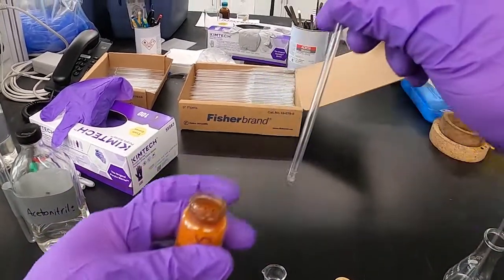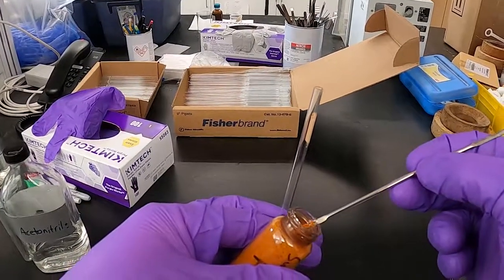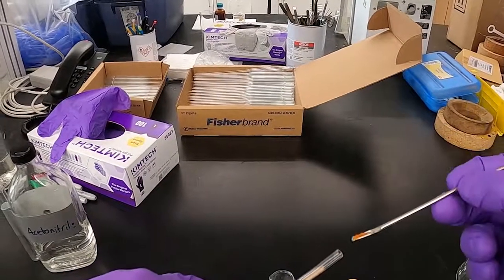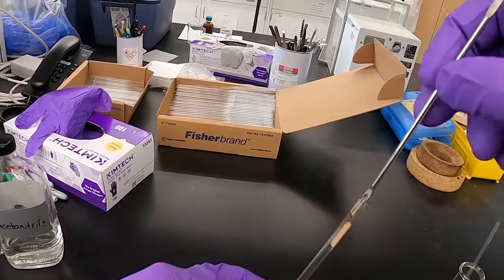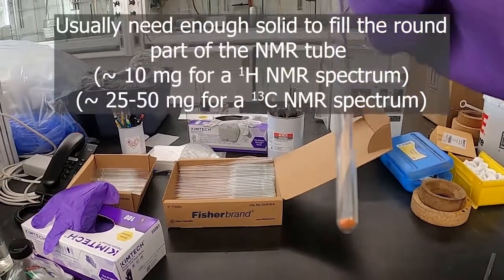Not all of that went in there, but that's okay. Let's try that again. There — about that much.